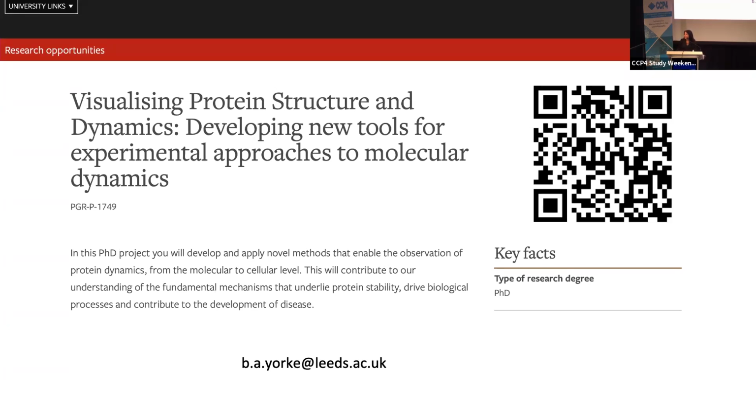I think this is where you have to start looking at other new methods and bringing in complementary data to be able to do that. You really want to be able to see changes in solution as well, at high concentrations in solution without aggregation. So it becomes quite complex. But something that I would like to move towards is direct imaging, so in a cellular environment.